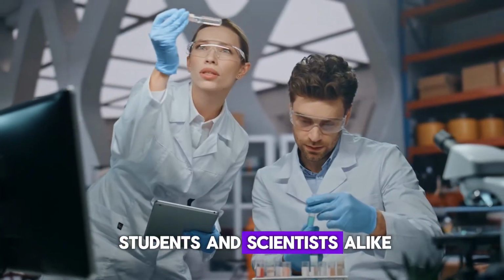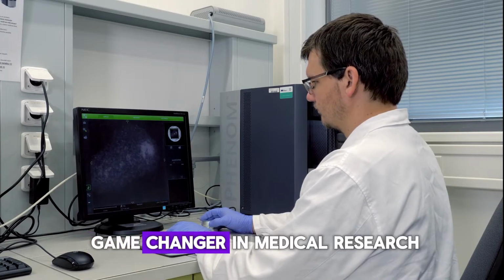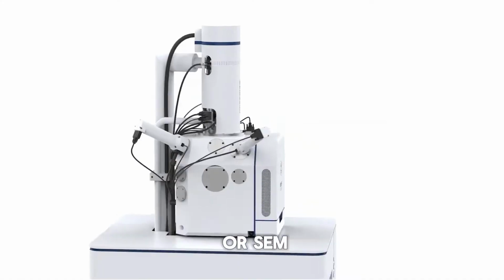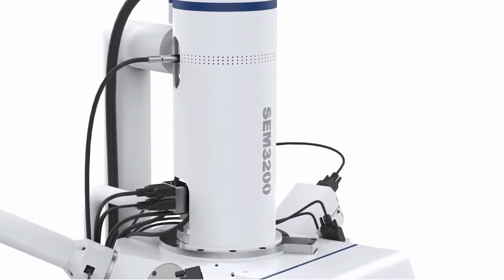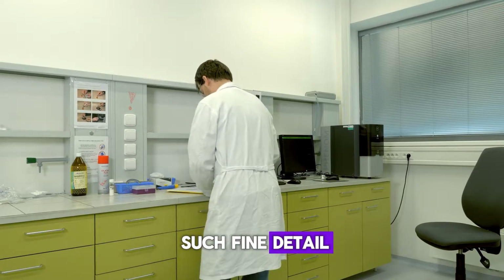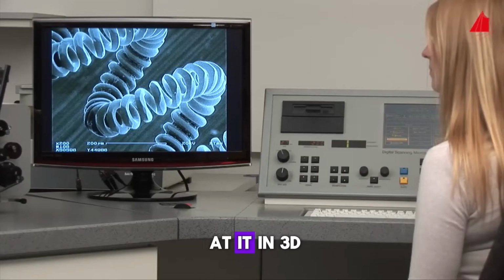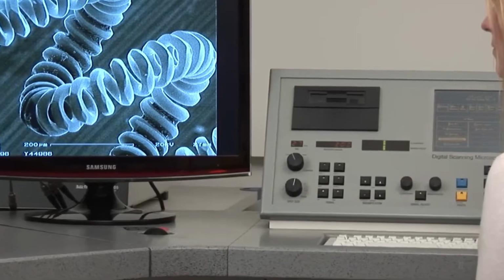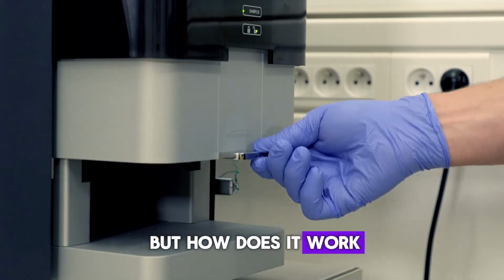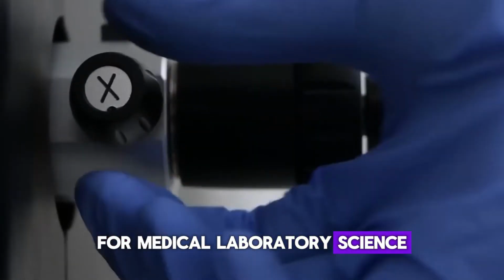Welcome back to Aladdin Creations, where we make science and medical laboratory content easier and more engaging for students and scientists alike. Today, we're diving into a game changer in medical research, the Scanning Electron Microscope, or SEM. Imagine being able to see a cell's surface in such fine detail that you can identify its texture and shape, almost like you're looking at it in 3D. That's exactly what the SEM allows us to do. But how does it work? And why is it so important for medical laboratory science?